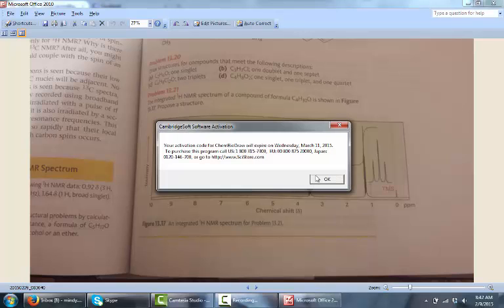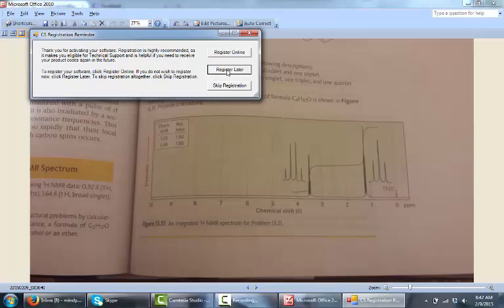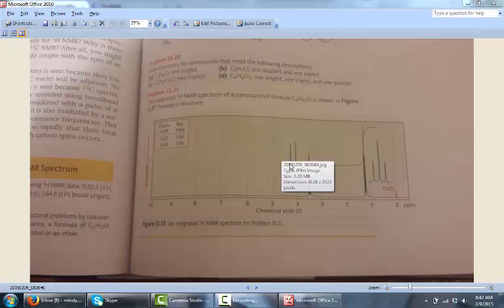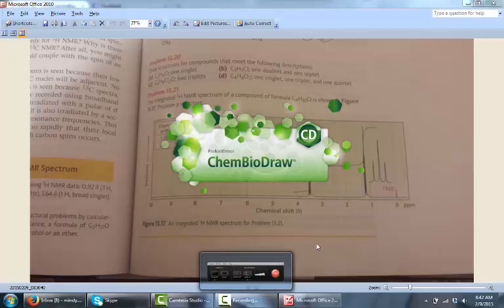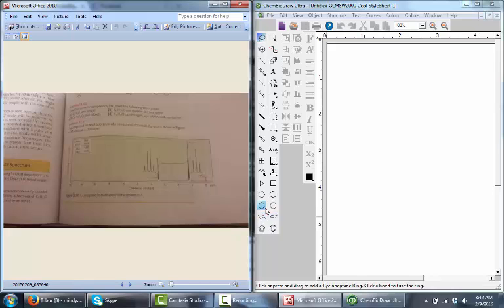And I'd say the first thing that we should look at here is that despite the fact that this molecular formula has 10 hydrogens in it, it still has only 2 signals. So it's H10, but only 2 proton signals. And that clearly indicates that we have only 2 types of protons in this particular molecule. So that's the first thing we're going to see from looking at that spectrum, that there are 2 types of protons.